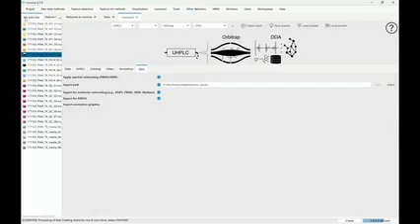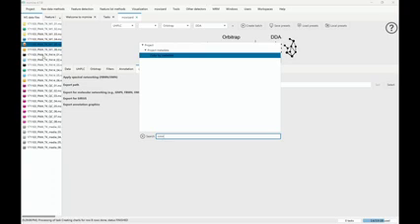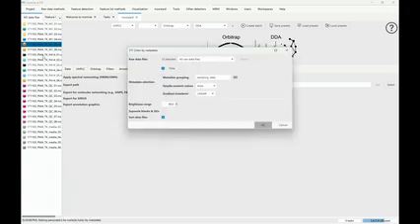but we can do so by just going to data files. And maybe if you have loaded the metadata and data, you can actually all do this. So I can just go here, and if you want to search something, like you want to do any analysis, you don't know if mzmine can do it, you can always Control F for search. Like any other tool, Control F, search. Or maybe double shift. Yeah, so double shift, Control F, you open this little window, and you can search for color by metadata. And color by metadata, if I hit enter, it's going to open this setup dialog for the parameters. And in here, we have metadata grouping.